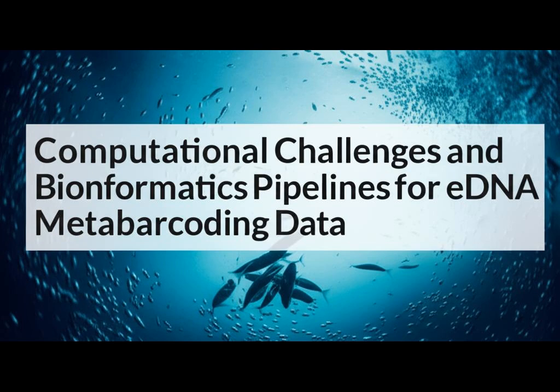Then, we process the sequences. Identical sequences are grouped together. That's dereplication, which saves a lot of computational effort. We also remove artificial sequences called chimeras, which can pop up during the lab process.